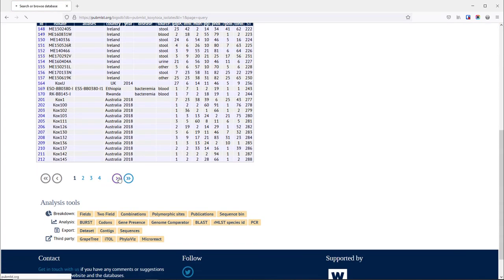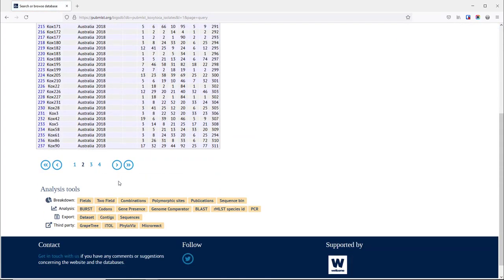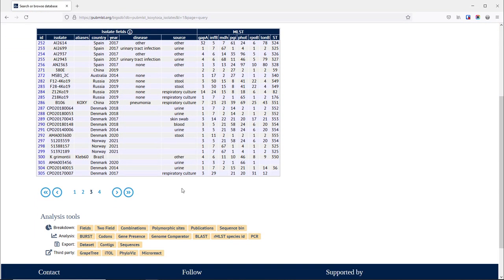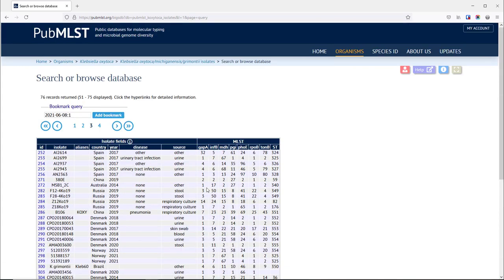The first couple of pages you find that everything looks okay, but on the third page here you'll see there are two isolates which are missing some alleles which have not been found within the genome. So we need to scan those to try and identify these and define the new allele sequences.